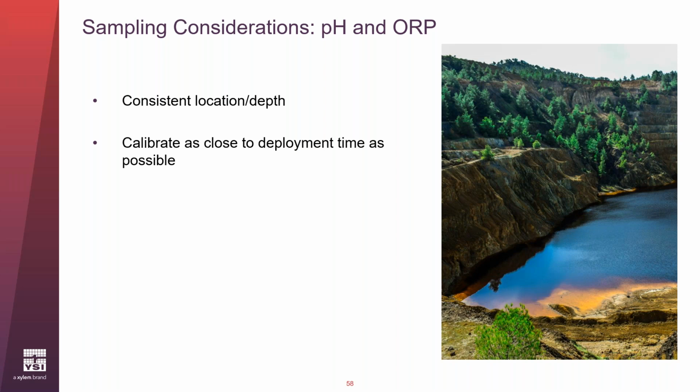So it is something that is to be expected, but it should generally happen pretty slowly, and it's generally something that you can mitigate by calibrating close to that deployment time.